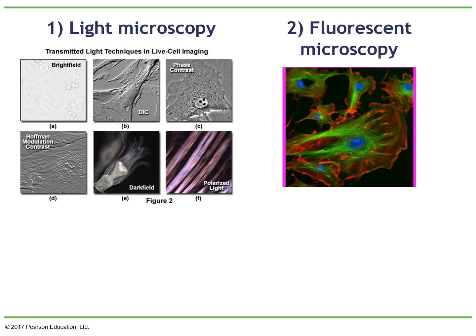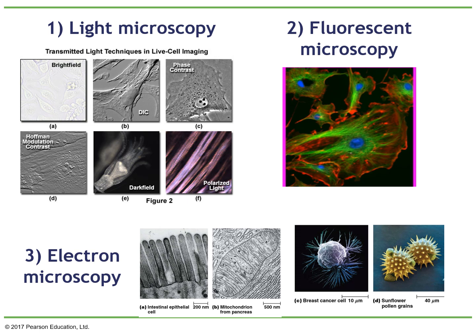Then we will move into another type of microscopy where we are not using the same type of white light. We're going to use fluorescent light, and we're going to talk about, okay, what is fluorescence? And then we're going to talk about different microscopes that use fluorescence. There are many. Here we're just going to talk about the wide-field fluorescence microscopy and the confocal microscopy. Then we are going to briefly talk about the electron microscopy.